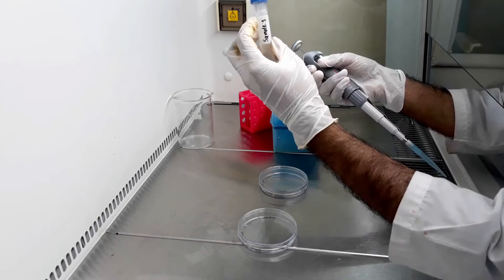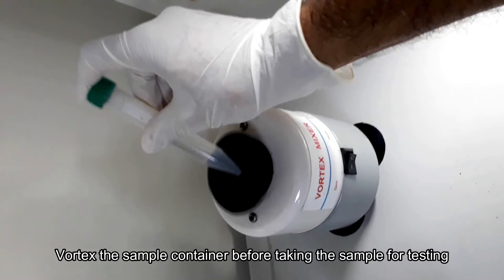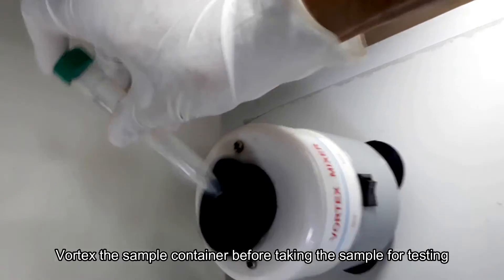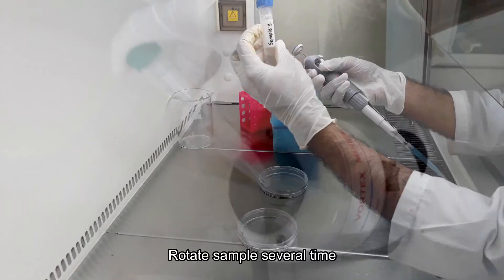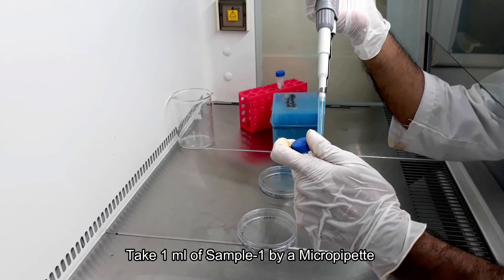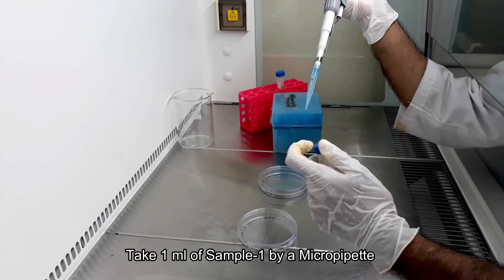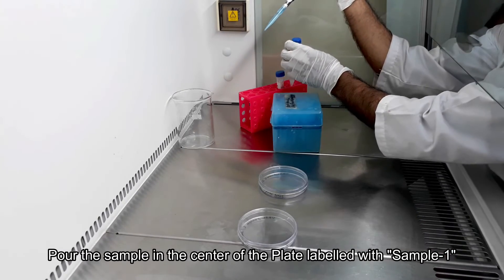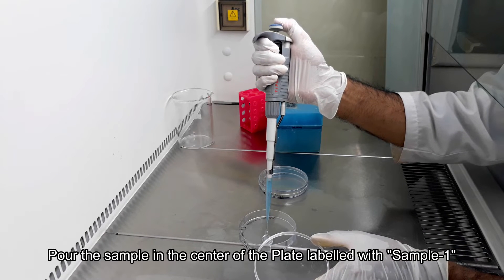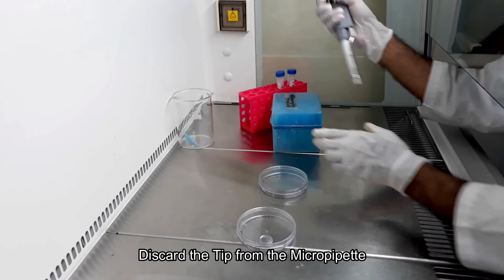Take the first sample and vortex it to make a homogenous mixture. Shake and invert the sample well before taking it for testing. Take 1 ml of sample 1 by micropipette and pour it on the middle of the petri dish. Cover the dish immediately with its lid and discard the tips from the micropipette.